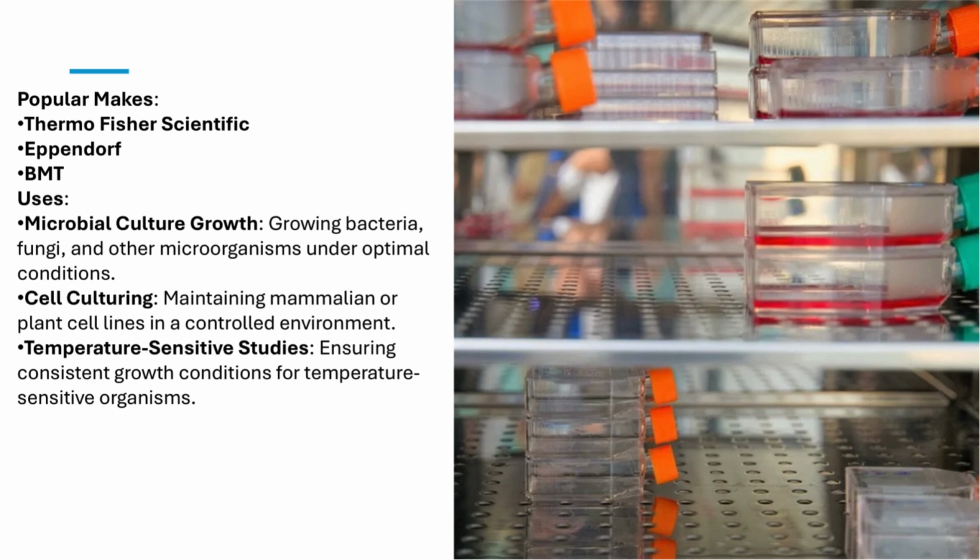Microbial culture growth. Incubators provide the perfect environment for growing bacteria, fungi, and other microorganisms under optimal conditions. Whether it's bacterial colonies or yeast cultures, incubators help ensure consistent growth. Cell culturing. For research involving mammalian or plant cells, incubators maintain a controlled environment to keep these cell lines alive and growing, which is crucial for everything from cancer research to genetic studies.